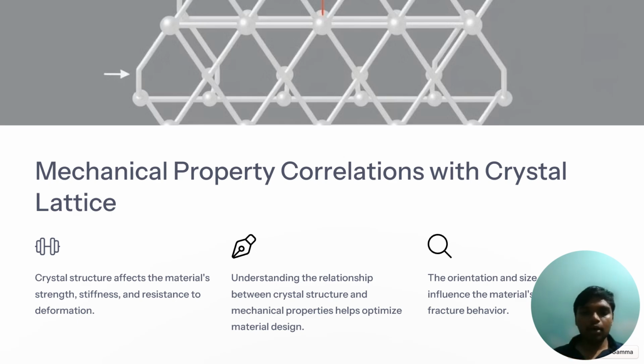Polyamide chains can adopt various conformations depending on the presence of hydrogen bonds between amide groups. X-ray crystallography allows us to determine the specific conformation of the polyamide chains in the crystal lattices.